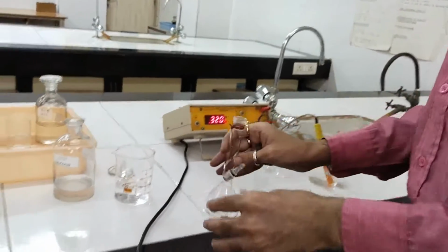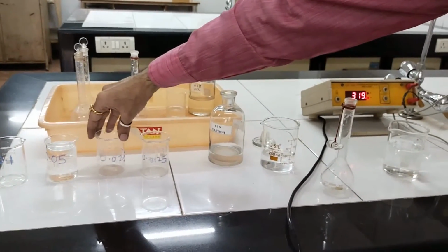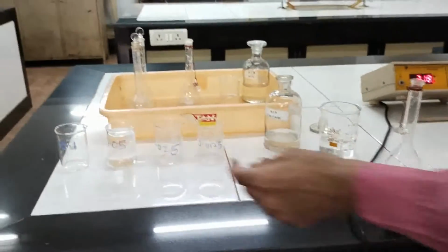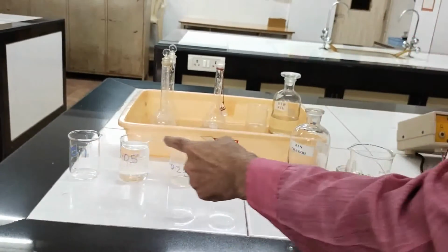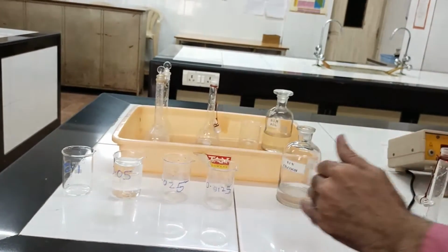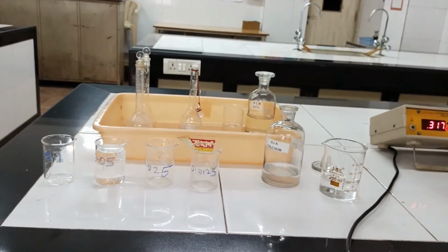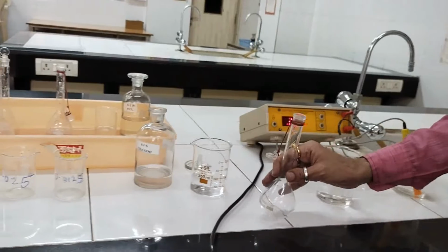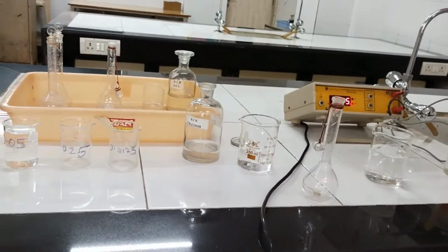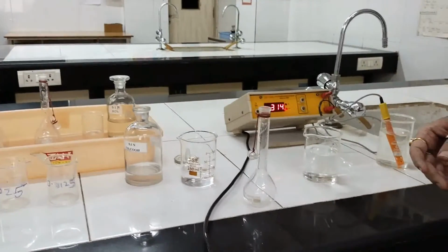Now we go for the next preparation of the solution, which is 0.025. Okay. So now if you do simple mathematics, 0.1 and 0.025, that means this is 1/4. So that means I have to do 4 times dilution, with the total solution being 100 ml. So I guess now you must have calculated, we have to prepare 25 ml, because 25 into 4 gives you what? 100.